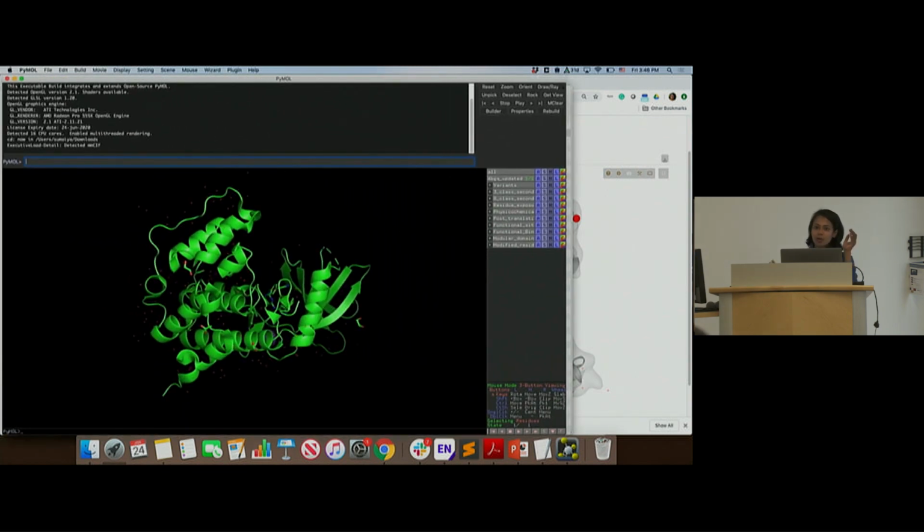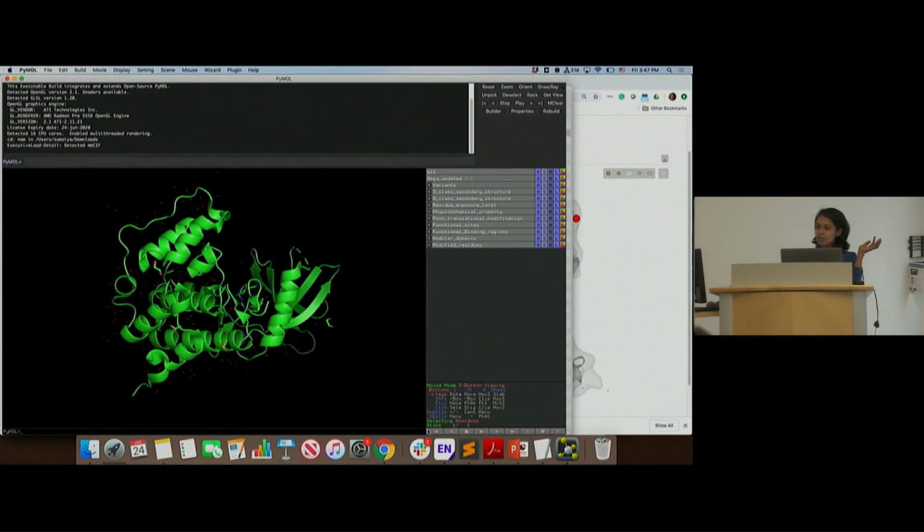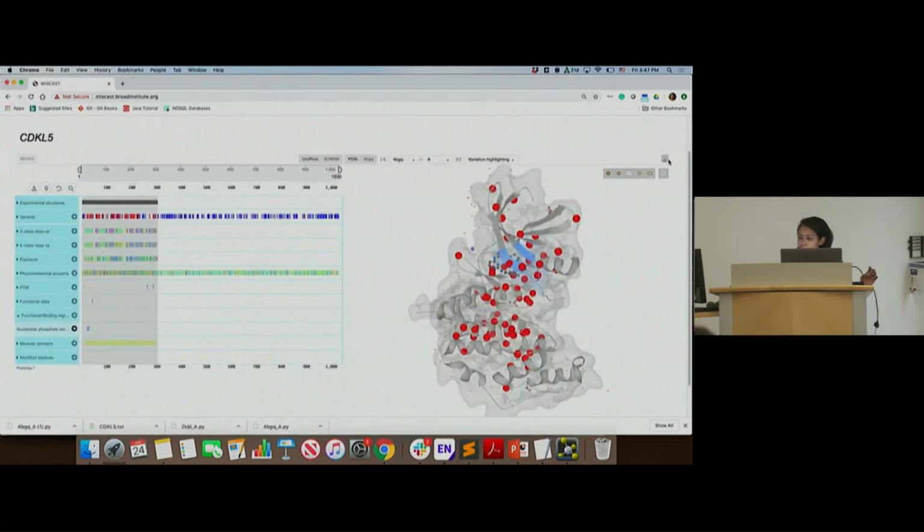So for the folks who are familiar with PyMOL, you know that there is this vertical bar here where all the selections can be saved. If you use this little bar down there and pull it to the left to see the full selection, then it will be helpful for you. Down there on the right, a little vertical bar. You don't find it? Of course, here.